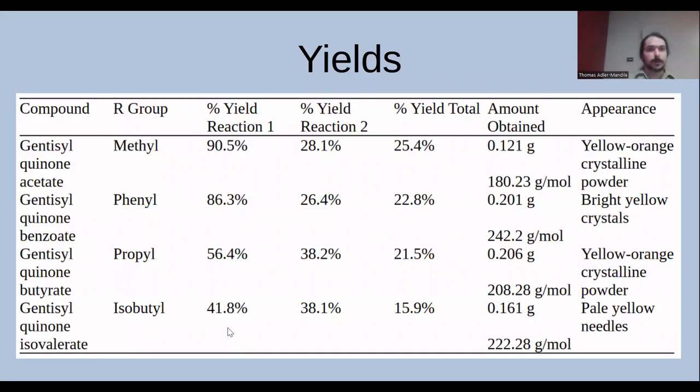So you can see what yields we got using the original procedure, the ceric ammonium nitrate and the acetonitrile water. Reaction 1 is pretty consistently good yielding, except for a couple here where there was some issue with purification, but you can get yields of above 90% with that first reaction, so that wasn't really a problem. But you can see here the oxidation step, right? The ceric ammonium nitrate step is pretty consistently inefficient. So we are focusing on optimizing the oxidation procedure.